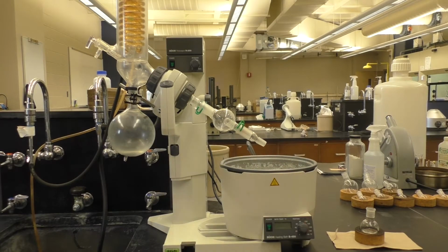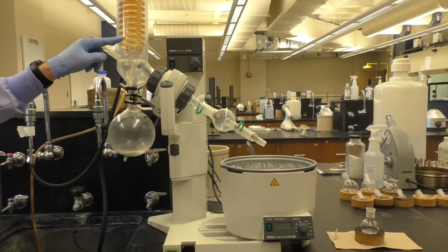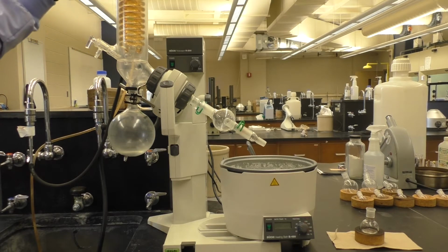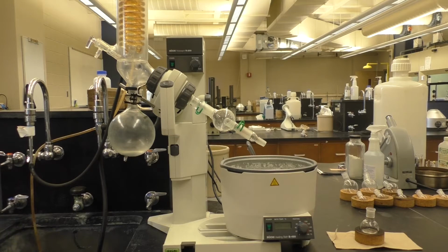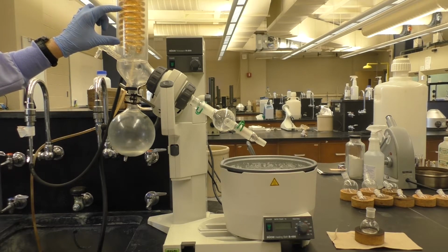So here we are at the Rotovap, and I'll go through how we operate one of these. It's different depending on the particular model or style of Rotovap. This one has a water-cooled chiller up here. Many of them have a cold finger that sits in here that would be filled with a dry ice and acetone mixture to get it very cold, but here we use simply a water chiller.